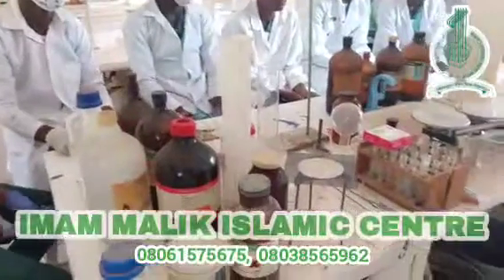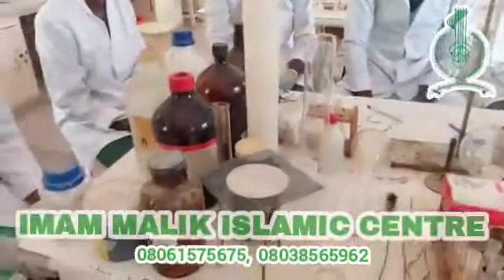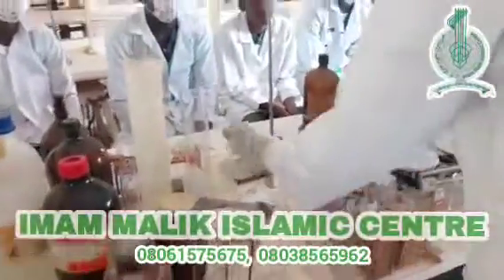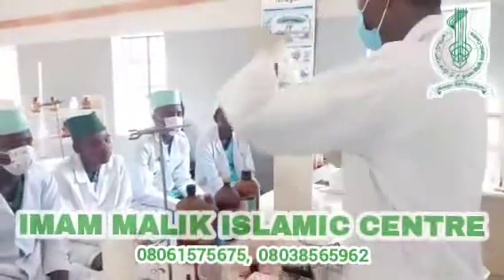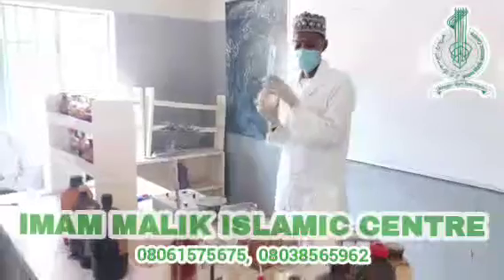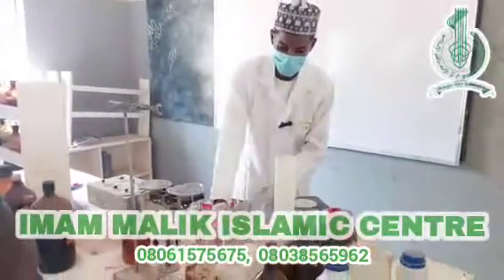As I was saying, we also have others that are designed for several functions or uses, like the volumetric flask. This one is a very good example of it. This volumetric flask is graduated 500 mL.